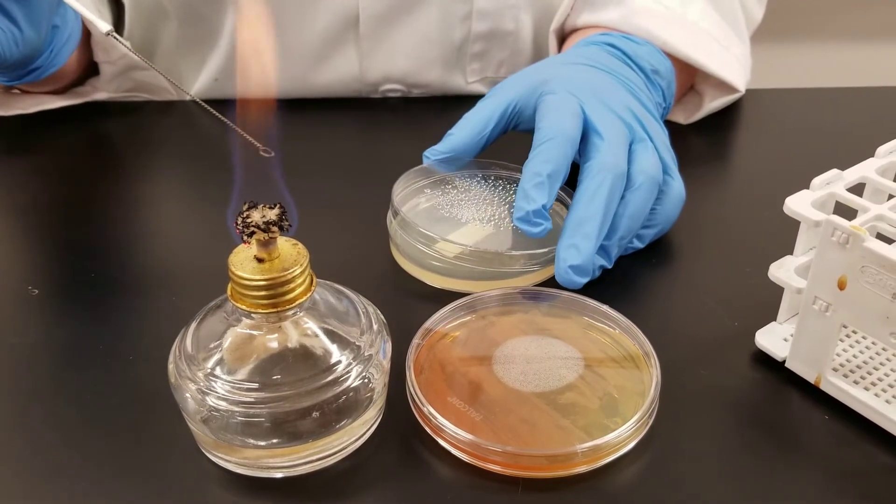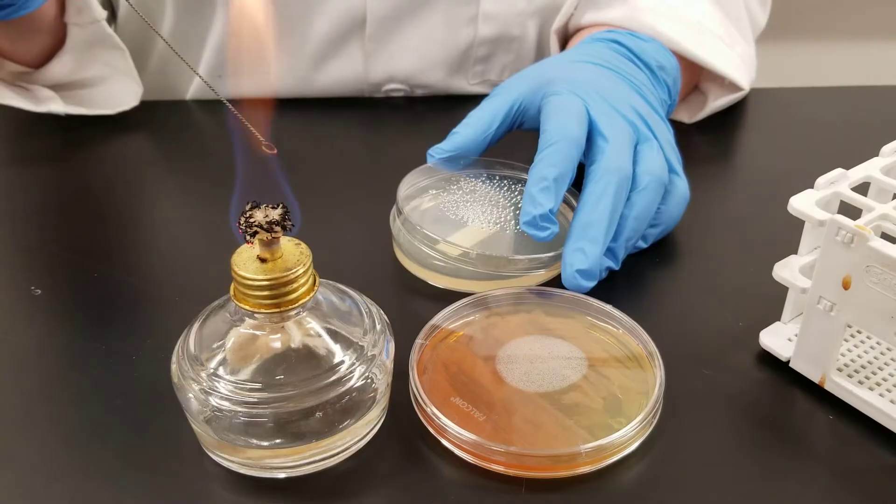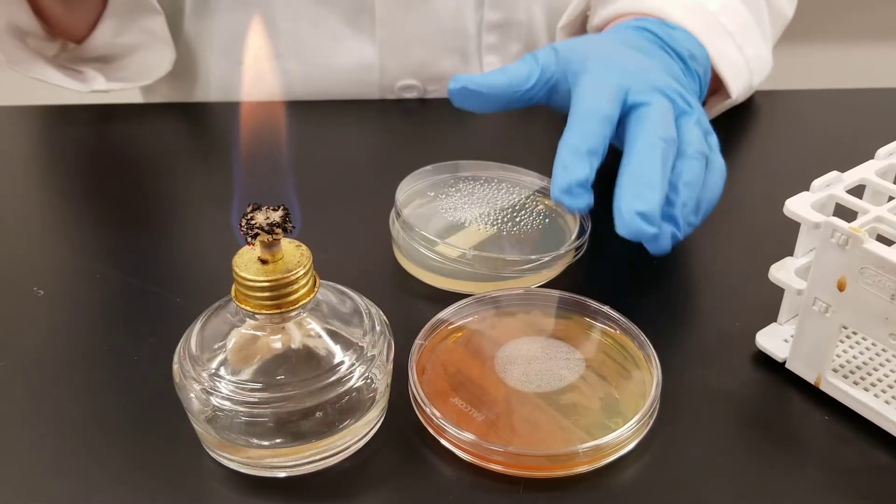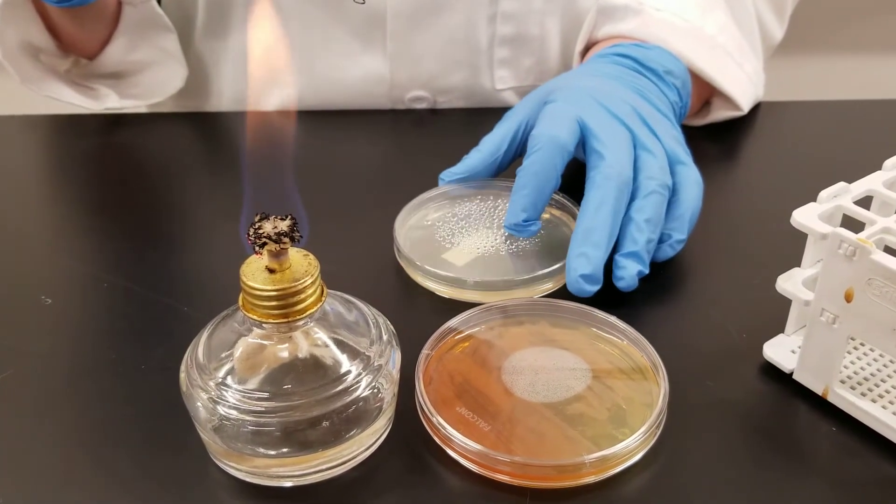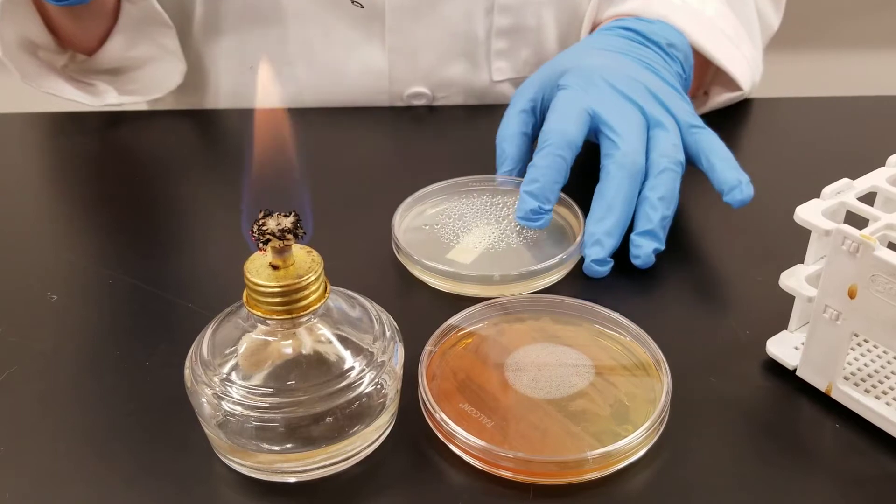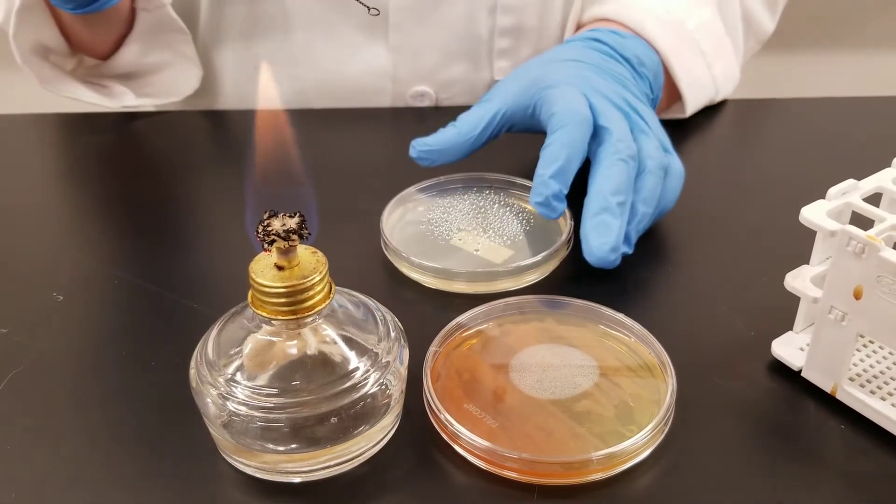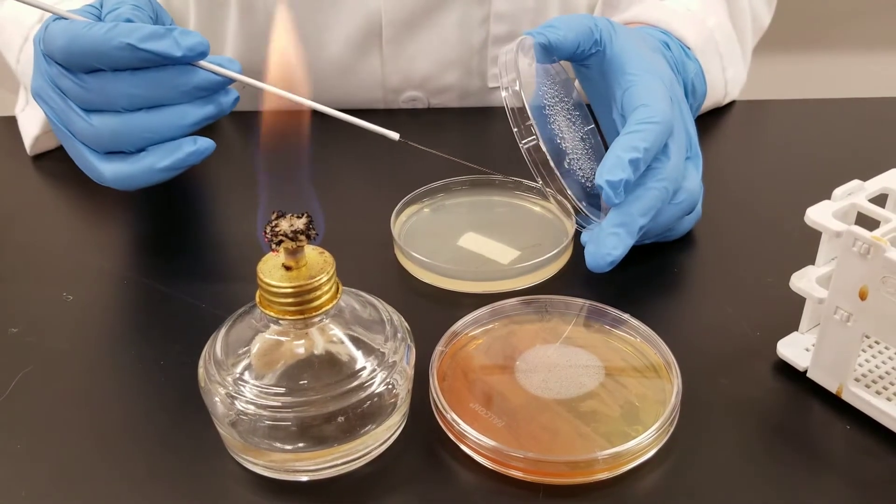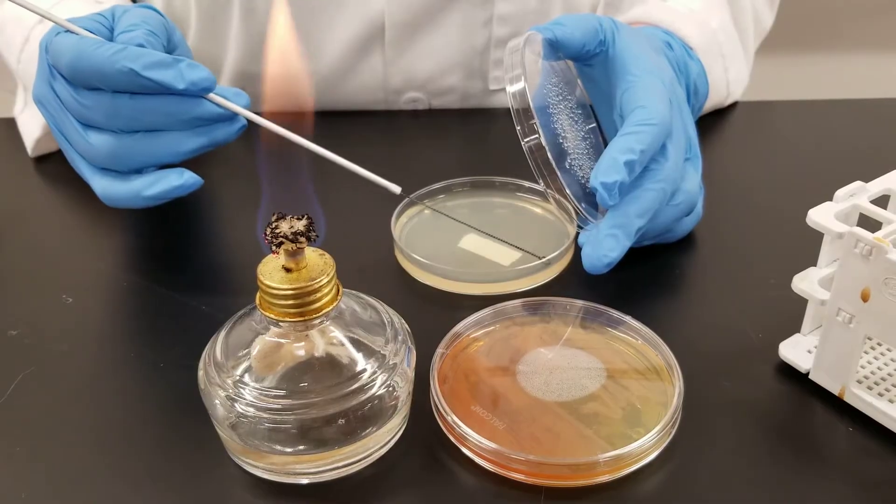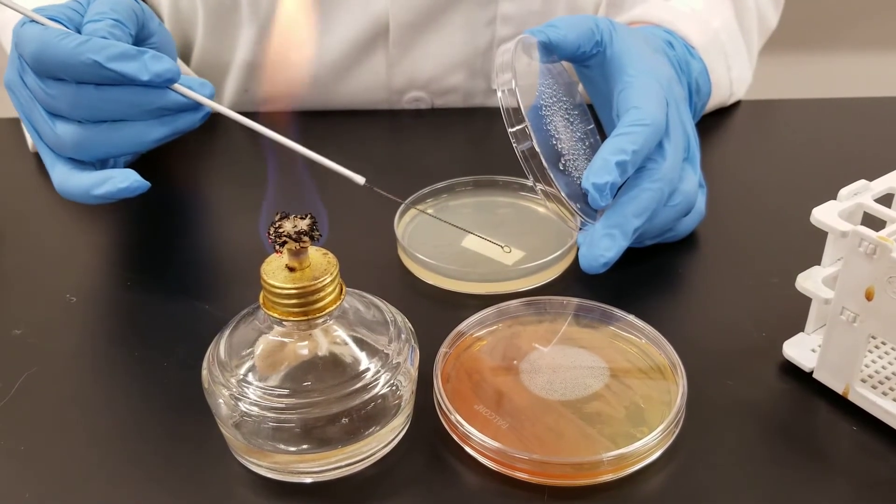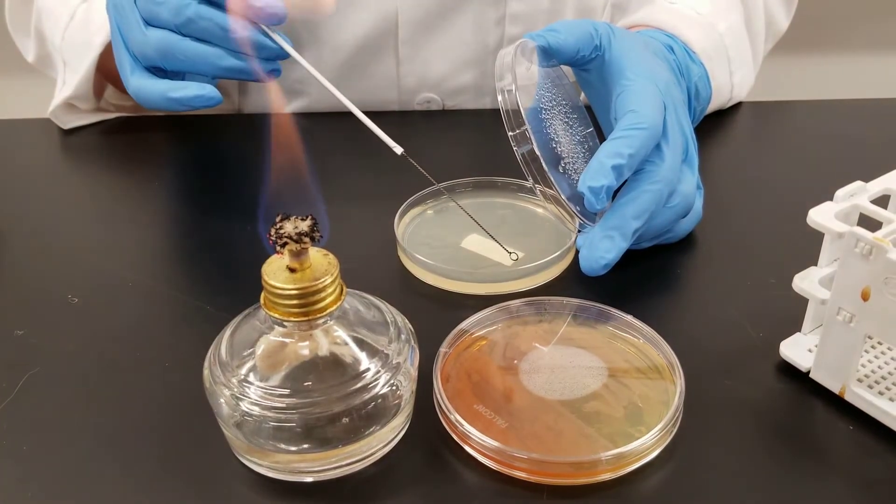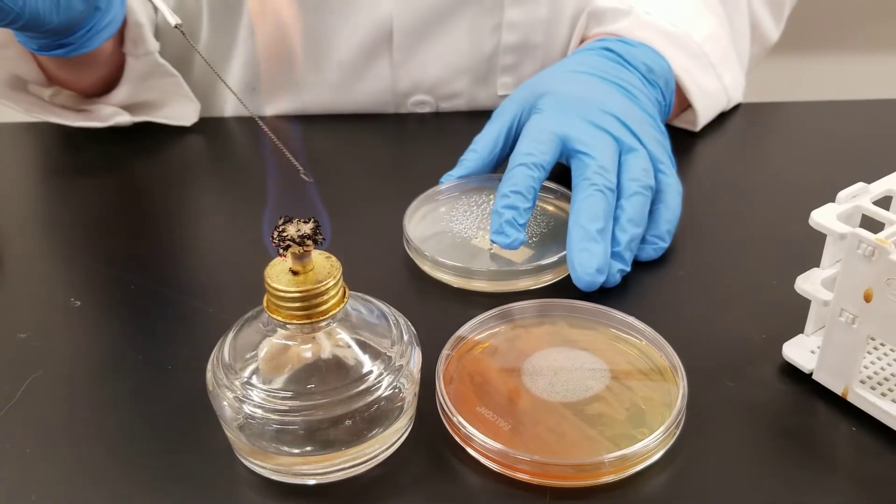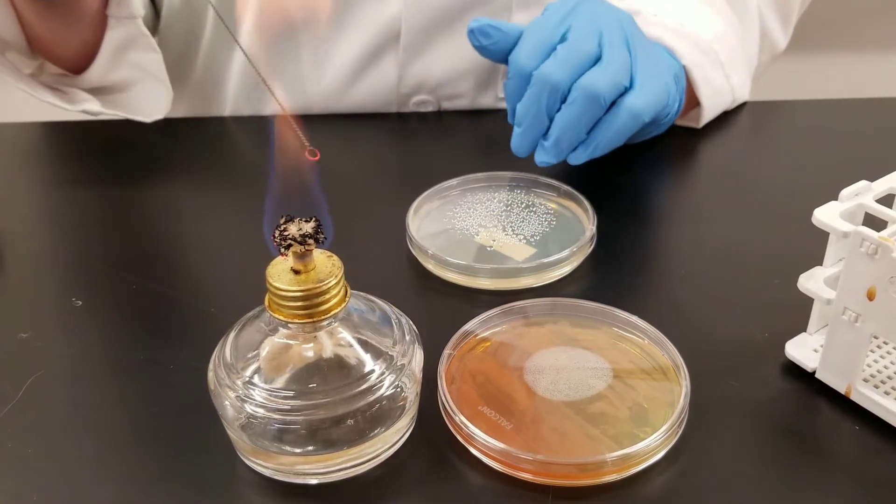Now I'm going to flame my loop. Let it cool. I do not go back into the stock plate. I'm going to go back into the area that I just streaked. That is where my inoculum is. You may want to turn the plate a little 90 degrees to help you with that. Go into the area you just streaked. That is where you're pulling your inoculum from. Streak out. Now I flip the loop over at this point. Go into that second quadrant area and streak out. The idea is you're diluting the bacteria out so at the end you will have isolated colonies.